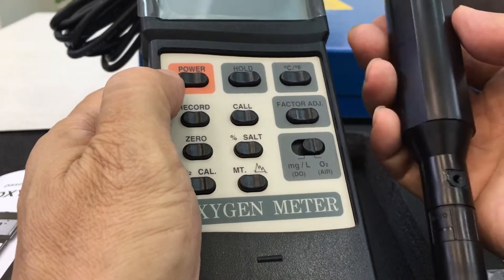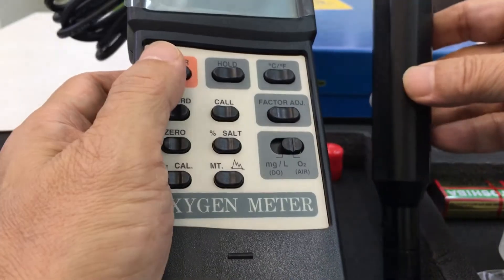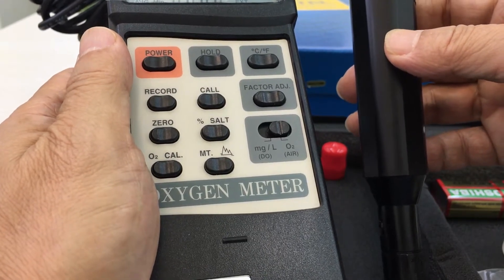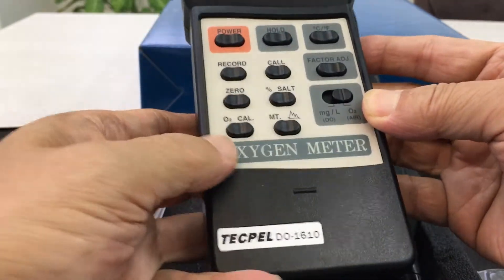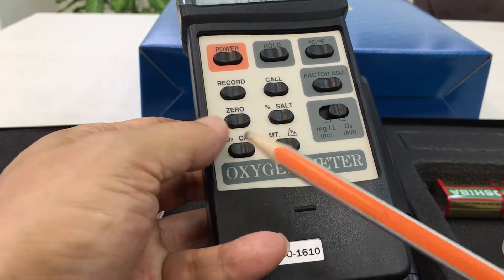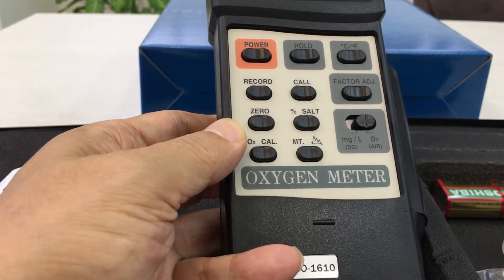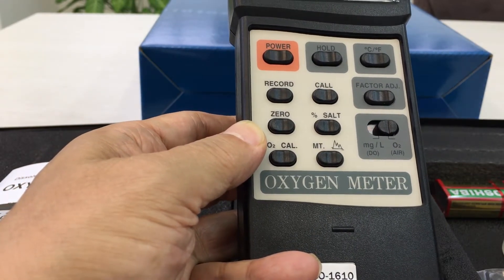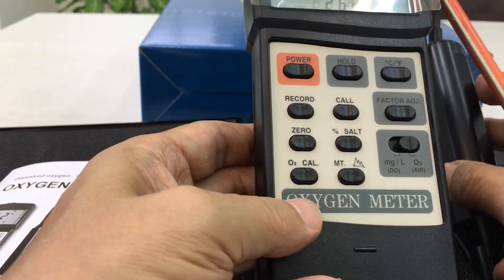Once you install the liquid electrolyte, put the power on. First of all, you should calibrate the O2. Here is the O2 calibration knob — adjust it to 20.9%. Calibrate until it reads 20.9, then you can use it.